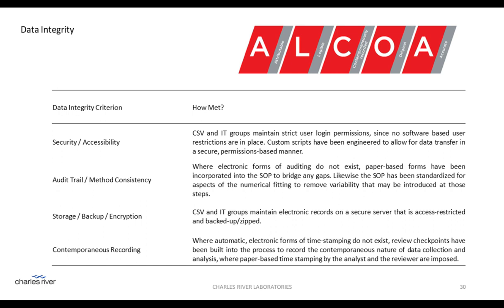And so the presentation thus far has been geared towards showing how the AUC assay can meet many, if not all, of the criteria of a validated assay, having reasonable results, as I've shown, for precision, linearity, and so forth. Results that make the case that the AUC assay is indeed fit for the purpose of judging the empty-full ratio and other properties. But one overarching characteristic of the AUC assay that must be present these days is the data integrity associated with the measurement of the electronic records and the downstream analysis.